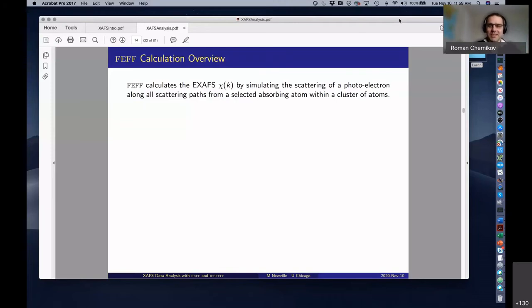So here's a question about XANES, how the muffin tin approximation affects XANES. But I believe the FEFF developers are the ones who would answer this question. I'm totally deferring to them on that. Ask them. Yeah. Right, so it's their territory.